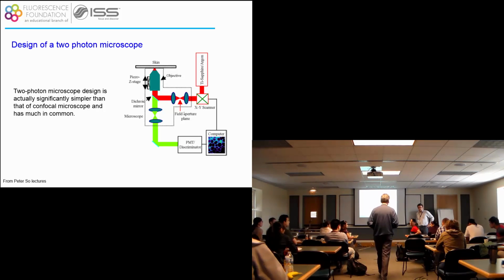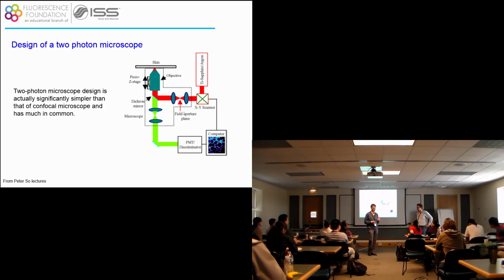This single molecule detection, is it about the sensitivity of the detection or about the resolution? Well, it's about the number of photons that you get out of the molecules. So when you do the experiments, you need to first select a good fluorophore, meaning a good quantum yield. Remember yesterday we talked about quantum yield.